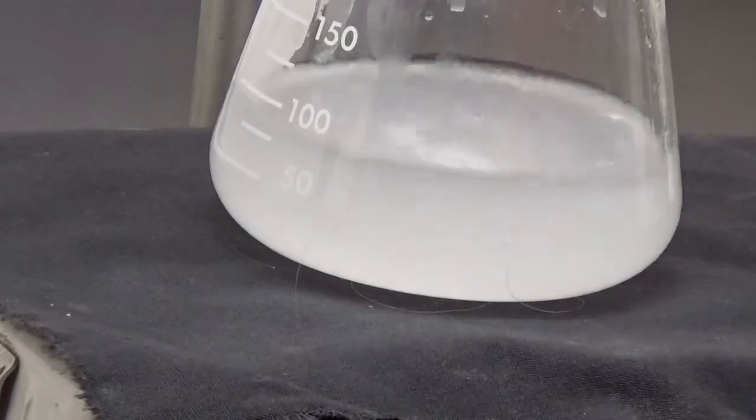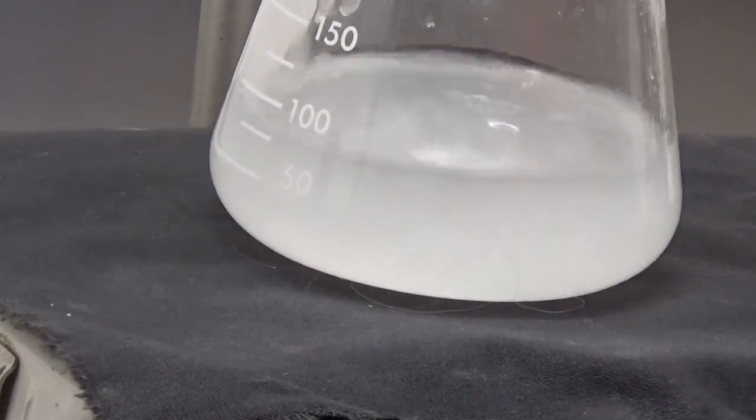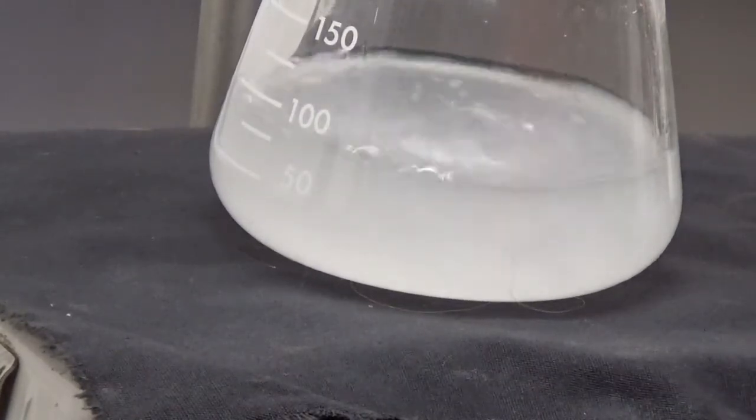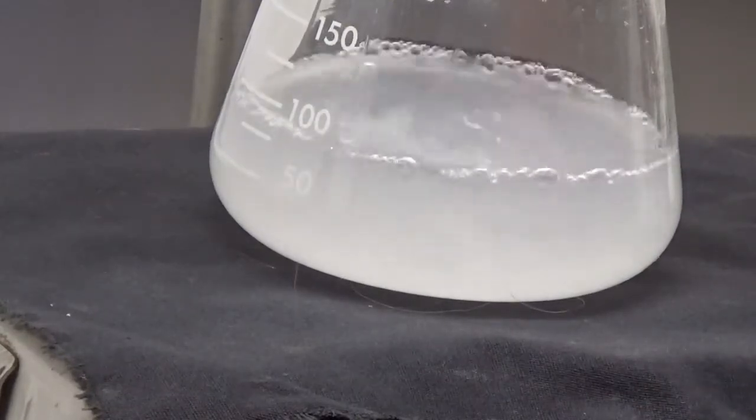It still looks pretty cloudy. Just adding continuously, but slowly. Doesn't look like I'm there yet.